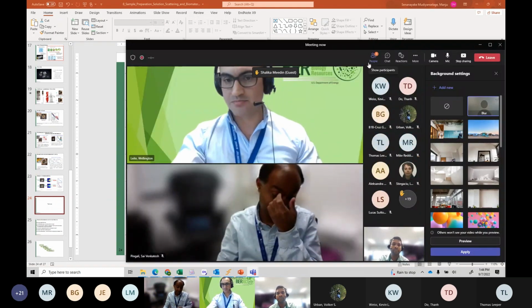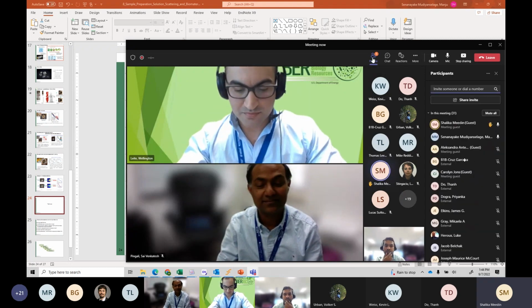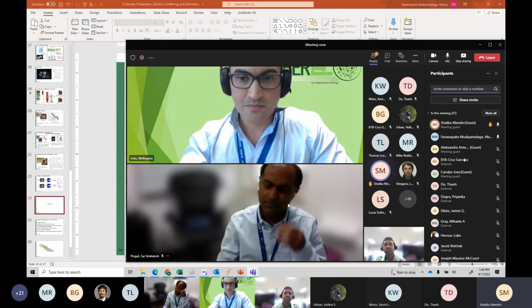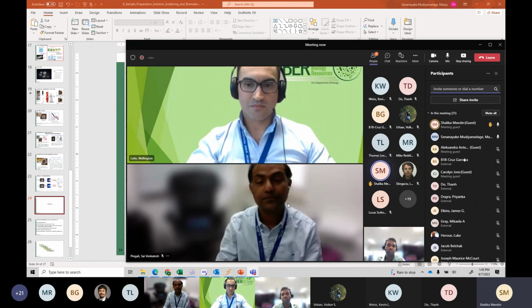Hi, nice talk, Wellington and Manju. I would like to ask, if I understood correctly, when you have a sample that sediments quickly, how does it affect the output, and what precautions are you taking? Is the sample rotating or something?